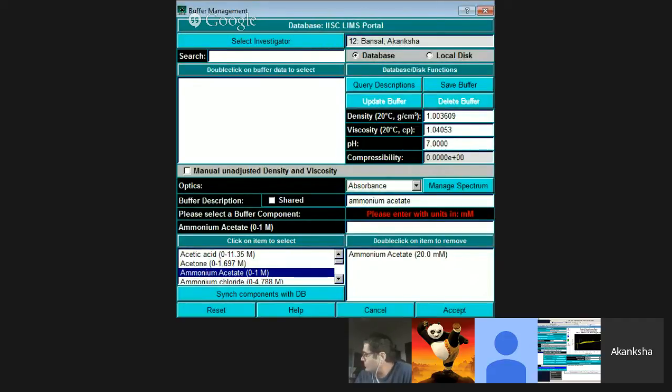Well, actually, I don't know, but when I use 50 millimolar Tris, I put some, I don't know, 1 milliliter. Yeah, it will be very, very minor, that contribution. I wouldn't worry about it. I think that's pretty much captured inside of the Tris. The Tris that's listed here is probably more or less made for a pH 8 or somewhere in that range. So unless you're very far off with that, I wouldn't worry about it, okay? Okay, thank you.